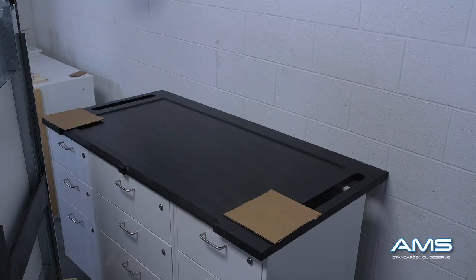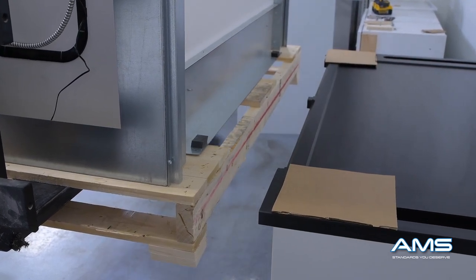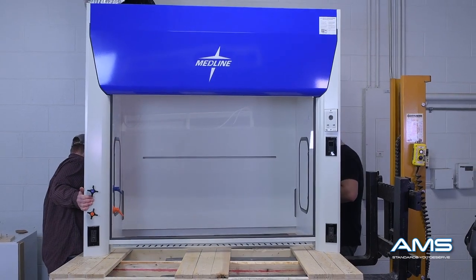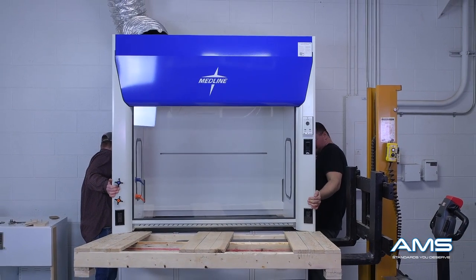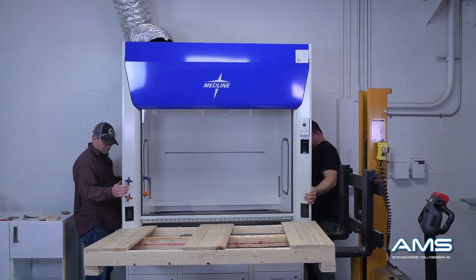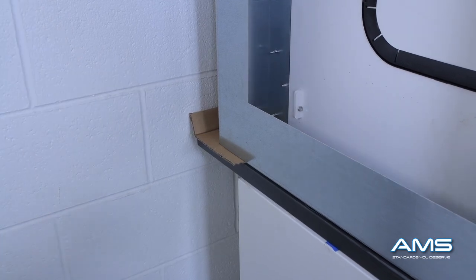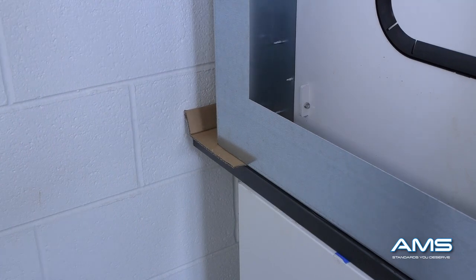Place two cardboard sheets down onto the countertop. These will help with sliding the hood back while also protecting the top of the countertop from damage. Now lift the hood onto the countertop and place it into position. Be careful and take your time sliding the hood back — try to do this as evenly as possible. As you can see, the cardboard helped slide the hood back while also protecting the counter from damage.